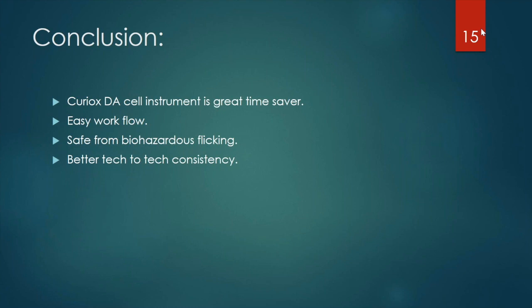It's a very good question. This would save a couple of experiments for you, because I faced some failed experiments because of just relying on vortex and not mixing it. You have to mix it manually with your pipette before you put it on the vortex.